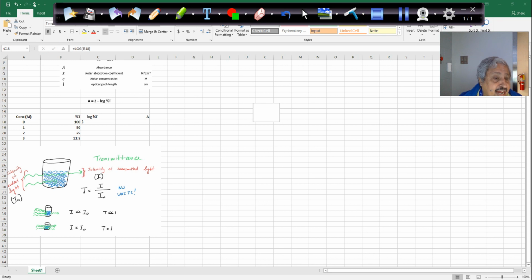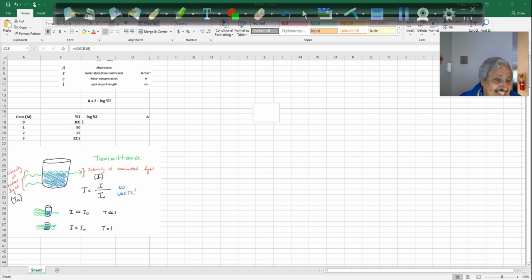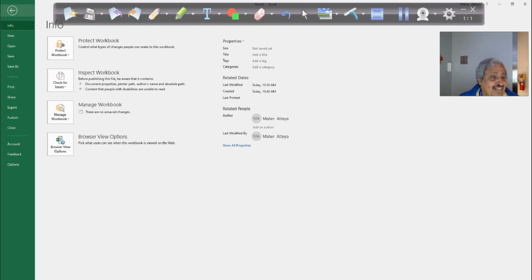Now I have to fill this one here. The easiest way is to highlight this one here, copy it, everybody's following? And then drag it all the way to the bottom and paste it. Here we are. And we'll save this as our work.